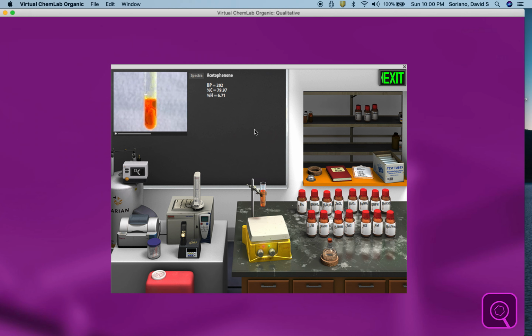And that's going to change to a precipitate, the 2,4-DNP phenylhydrazone derivative. That was the time-honored method of determining structures of aldehydes and ketones by making them into crystalline derivatives, such as 2,4-DNP. I'll get rid of that, put another sample up.